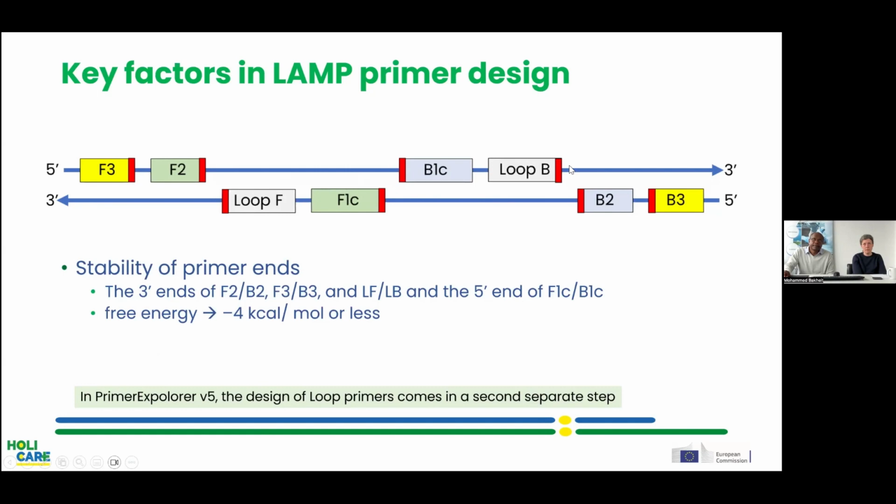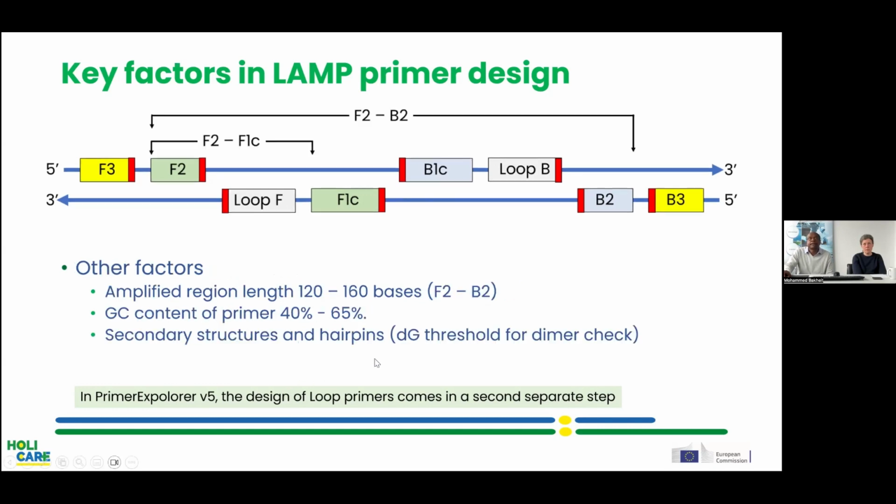I need to mention at this stage that the design of the loop primers, these 2 optional primers, is always in a separate step in Primer Explorer. So you first need to have your 4 main primers, and if you are happy with your primer set, then you can proceed to design the loop primer set, as I will show.